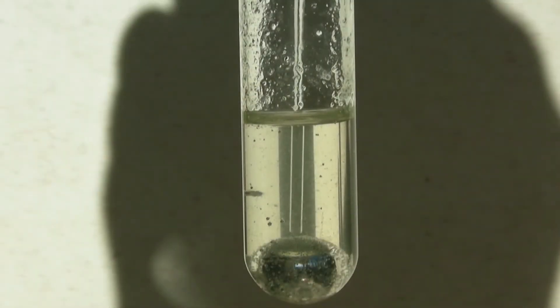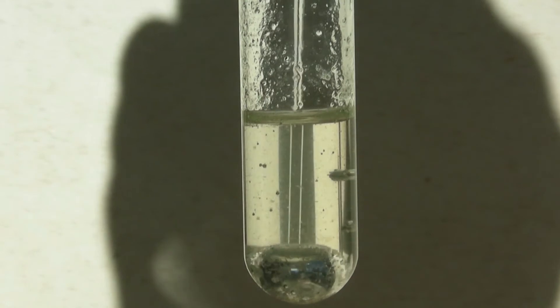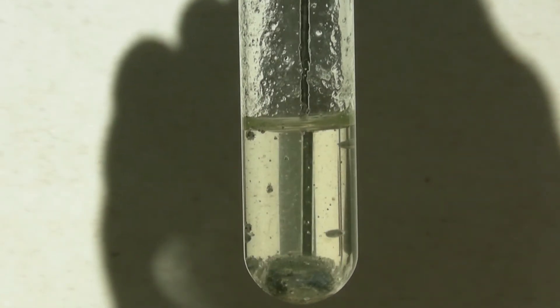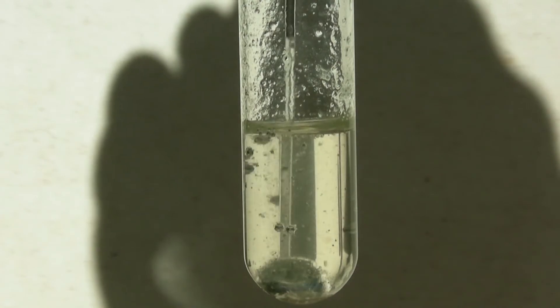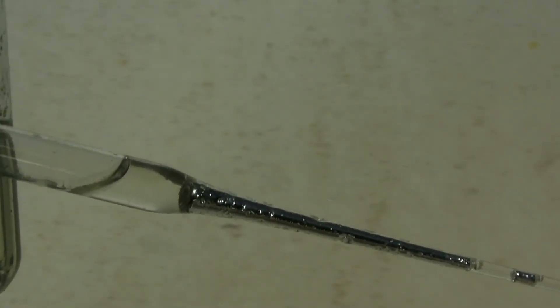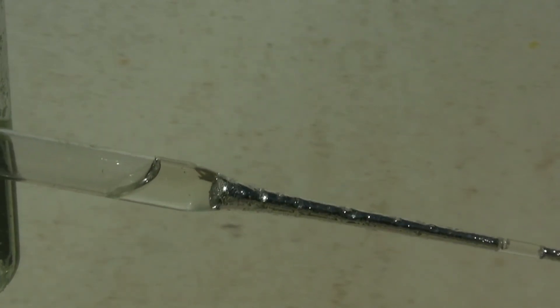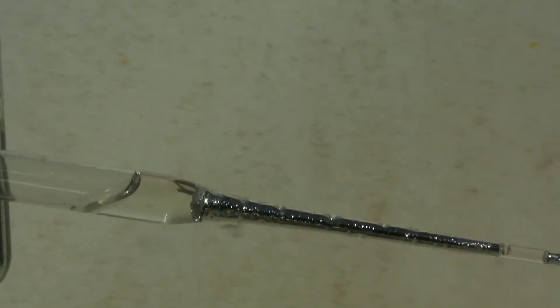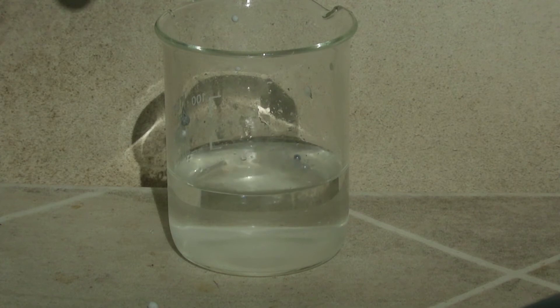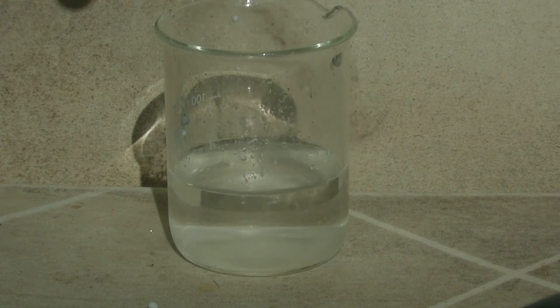With a glass pipette it could then be drawn up. It is important that a bit of solvent is drawn up at first to prevent the NaK from reacting with the air in the pipette. The wider opening of the pipette allows larger drops to form, which give a better impression of the high reactivity. It often causes the drops to jump out of the water before they have even reacted completely.